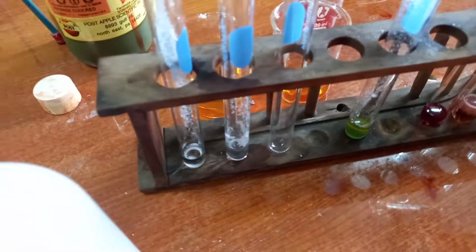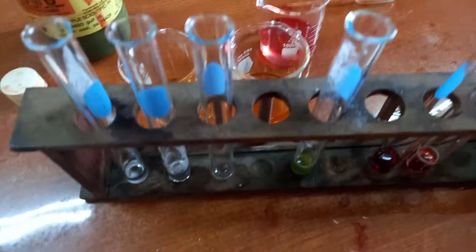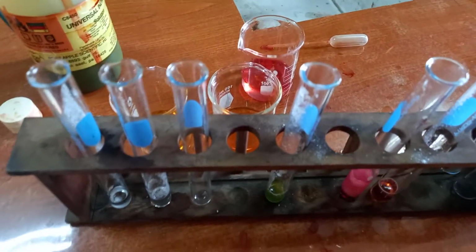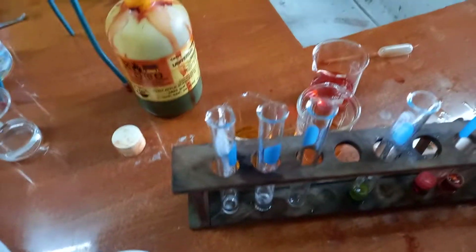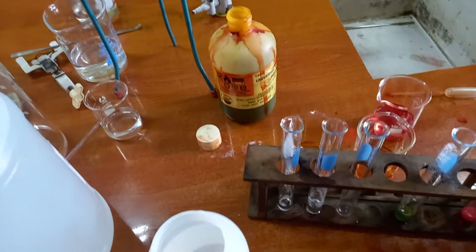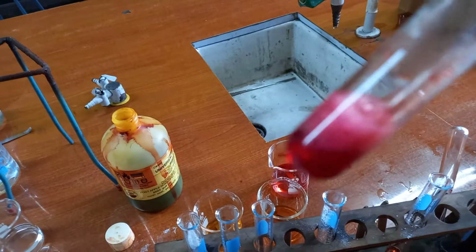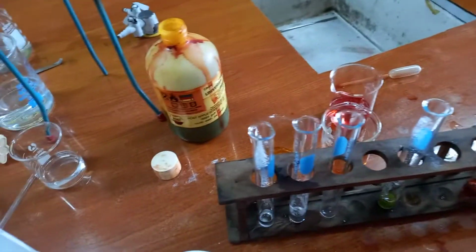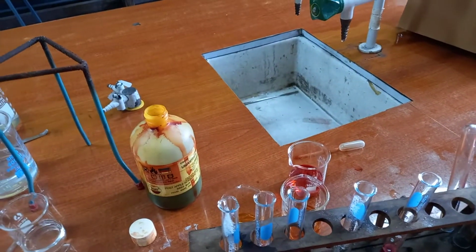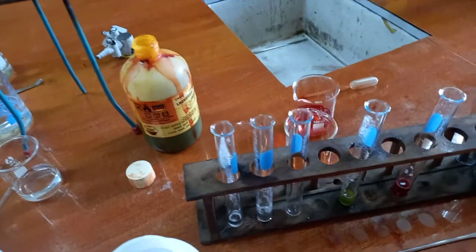Alright, can show that more. Alright, so here we go. And you can see that it reacts vigorously, just like our known carboxylic acid. So we can confirm that this is the aldehyde that was oxidized to the carboxylic acid, right? And you can note the color change of the indicator. Remember, it was red and it's now like this.